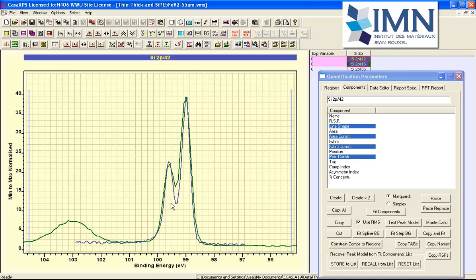What this does show us is that we have a good valley between these doublet peaks, indicating that we really have a reasonable energy resolution, and that if this is an oxide peak, then the blue spectrum does not indicate there is any significant amount of oxygen that is associated with this region here that we would expect to be rising as a consequence of this oxide peak.